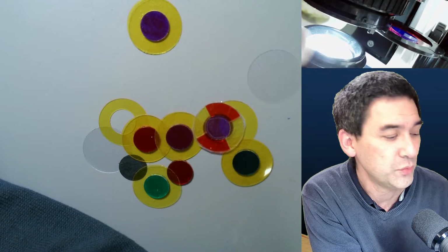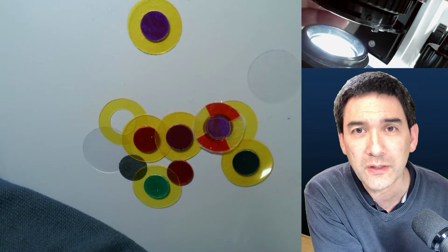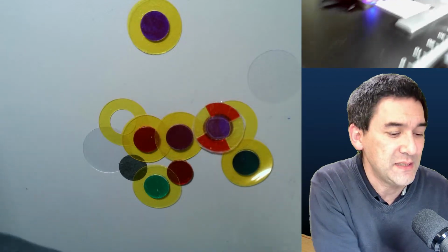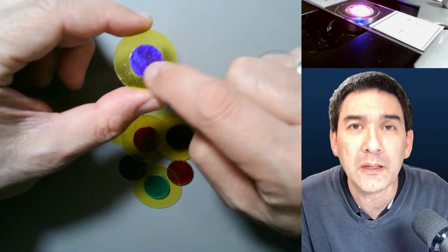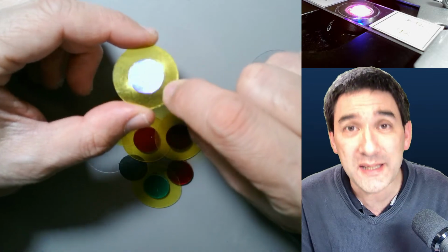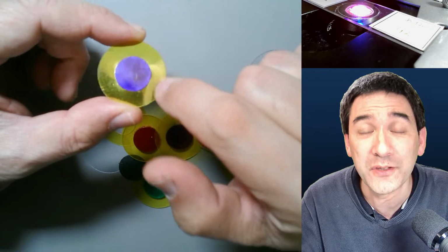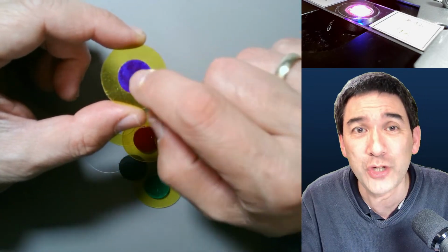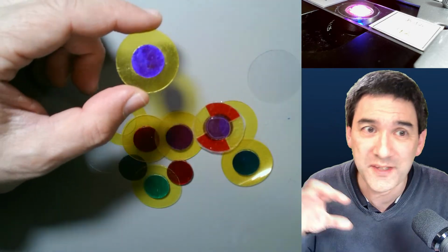Yeah. And what is really important now, and this kind of tries to answer your question, is that when you put the filter in place, and because there's an optics in here, what will happen is that the central part of the filter will become the background. So the background here would be blue, and the specimen, provided that it's able to refract and redirect the light sufficiently well, will have the color of the periphery here. So what you're able to do is change this way the color of the background and the color of the cells that you want to look at.